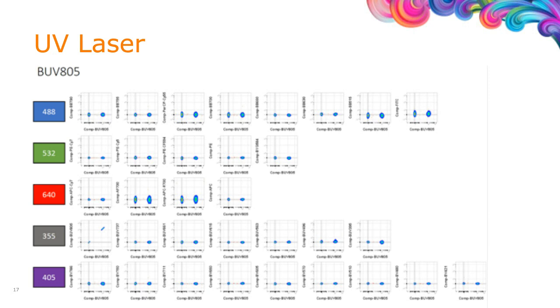Our problem, as we all know, is in that 600 range. So the colors at the end of every laser can be used very effectively in panel design. Something that lots of individuals don't pay a lot of attention to, but there is a story for each individual laser line.